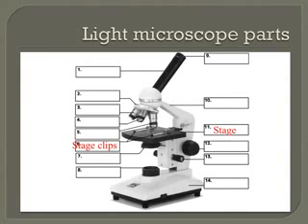With compound light microscopes, you're almost always going to use slides to view whatever you're interested in looking at. Sometimes you will just use already prepared slides, and sometimes you'll need to make these slides yourself. Once you have obtained a slide, however, what you need to do to view the contents of the slide is place it properly on the microscope.